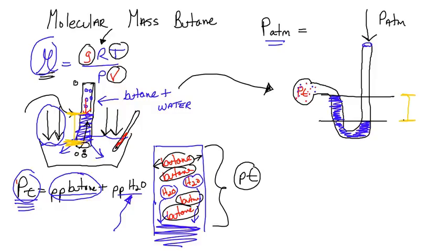Well, the first unit of pressure was basically the pressure needed to elevate a column of mercury fluid. That was the first manometer that Torricelli made. So not only is this pressure pushing back this gas, it's also suspending or holding up the weight of the water. Remember, the weight of the water is pushing down.